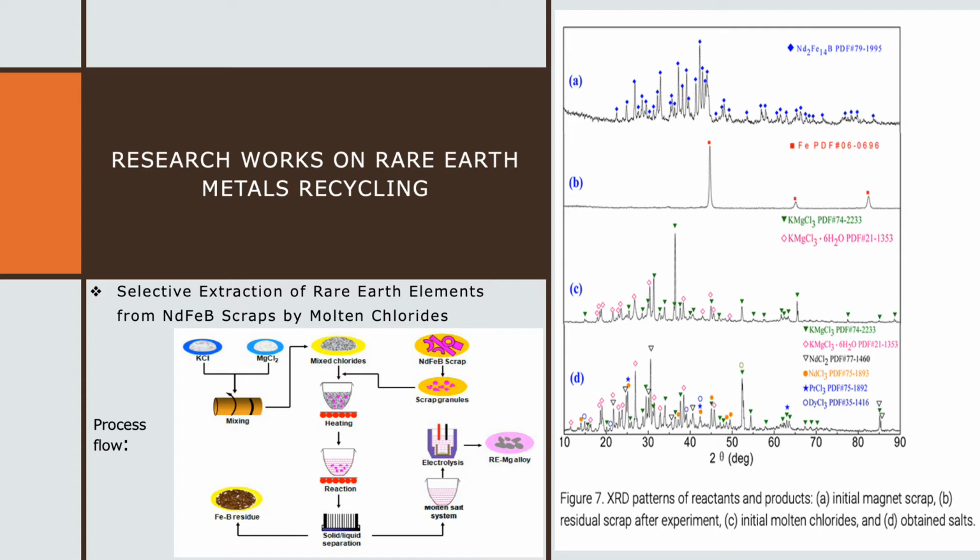In this experiment, the mole ratio of magnesium chloride to potassium chloride was 6:4, and the molten chloride mixture was crystallized to form the orthorhombic phase of potassium magnesium chloride (KMgCl3) during cooling to room temperature. Meanwhile, diffraction peaks of hydrated potassium magnesium chloride were also detected as a result of the deliquescent property of magnesium chloride. This is seen in curve C.